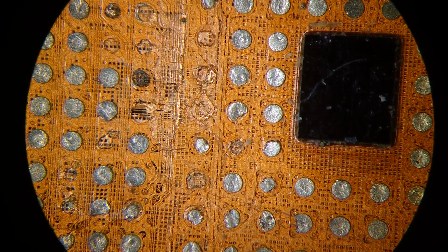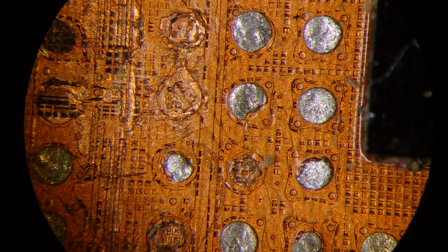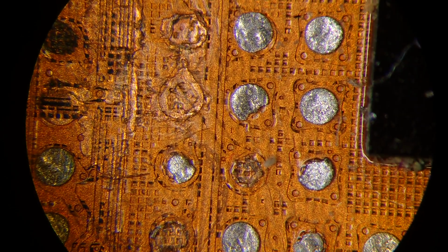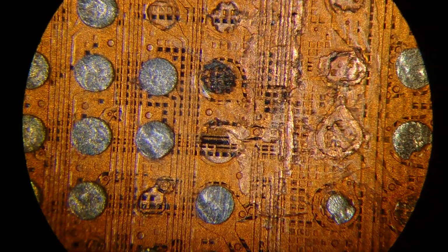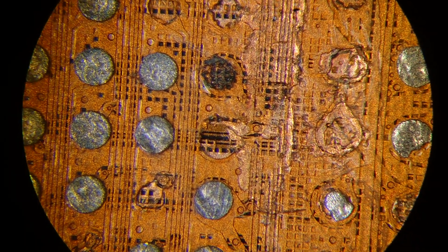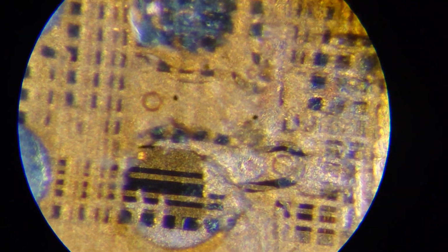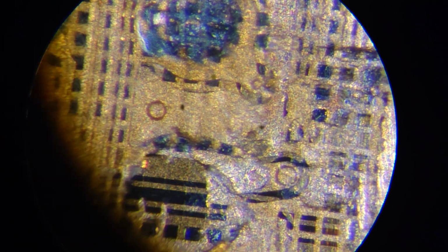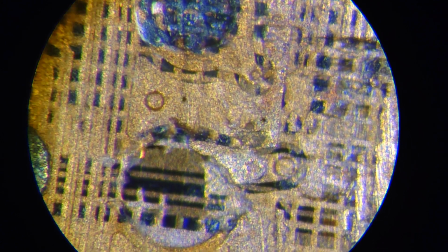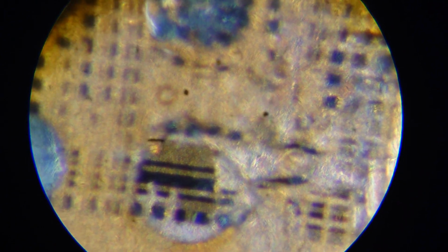Okay. We still have room to... Oh, now we reached the top, the end of magnification, the upper part. So let's move over the processor a bit. But as I have said to you a lot of times, if you want to see the real resolution this microscope gives us, you need to switch to my other eyepiece that is supposed to be used for getting the real resolution of objectives. So pay attention please. When I focus on the top wires, bottom wires are fuzzy. When I focus on the bottom wires, top wires are getting fuzzy and the bottom ones sharp.